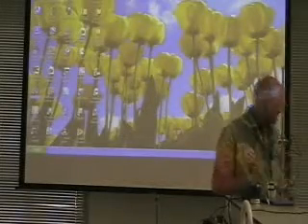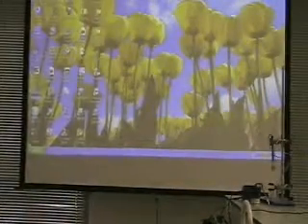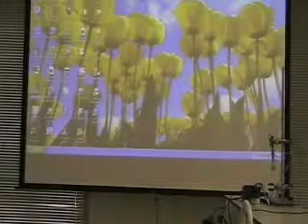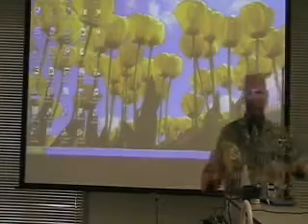But what I want to show you is that using pH to measure reaction rate is not as straightforward as you would think. At the same time that I'm using pH, I'm also going to be using temperature. So we're going to map those two things.